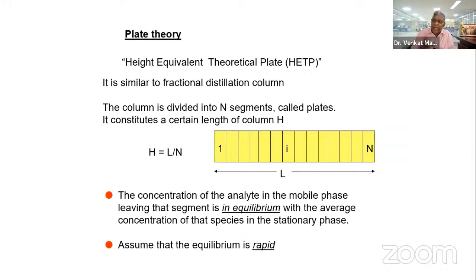Now, you take this mixture in a flask, apply a small amount of heat. Now, what happens? Because the boiling point is low, your hexane will come first. If you keep the temperature constant, at that temperature all the hexane will come out.